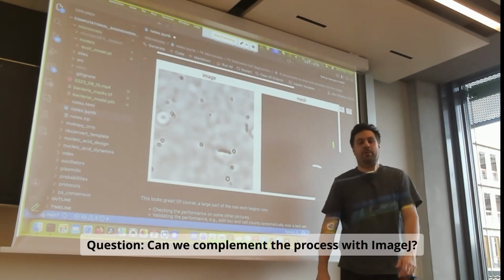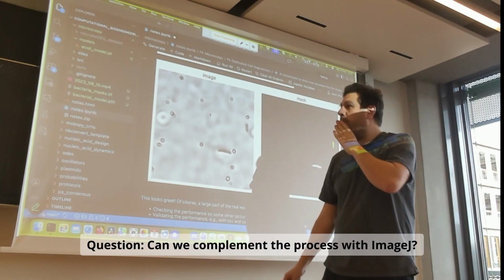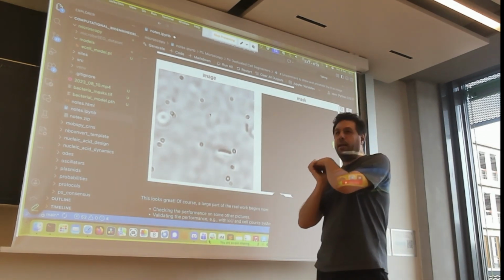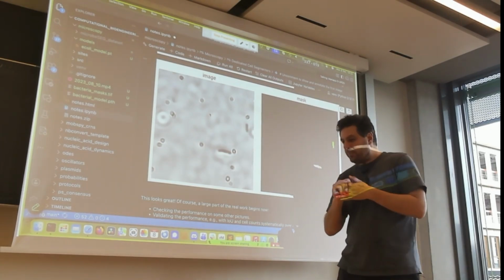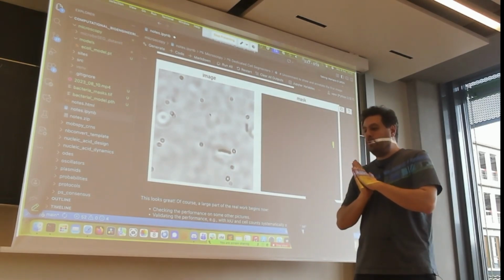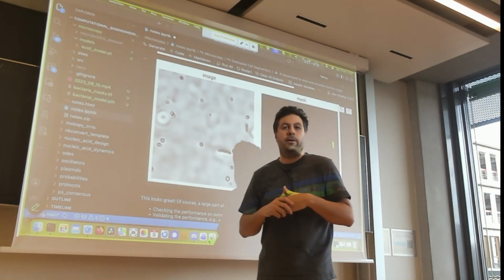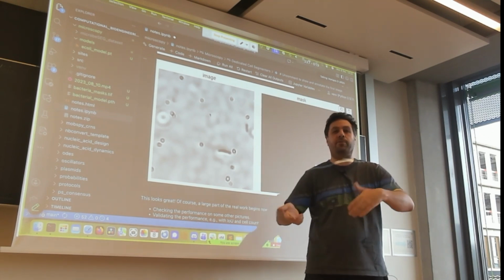Yeah, definitely. So ImageJ is a great product. We didn't present it here because it's a bit our philosophy to have everything completely run in Python. Everything is code. That's the reason we wanted to show you how you can code everything from the bottom to the top. But ImageJ is a very good tool to prototype, to look into such pipelines. The downside of the approach I showed you here is that you have to code everything out. If you decide, for example, to use this segmenter, you have to code it. Or if you decide on another segmenter, you have to code it.